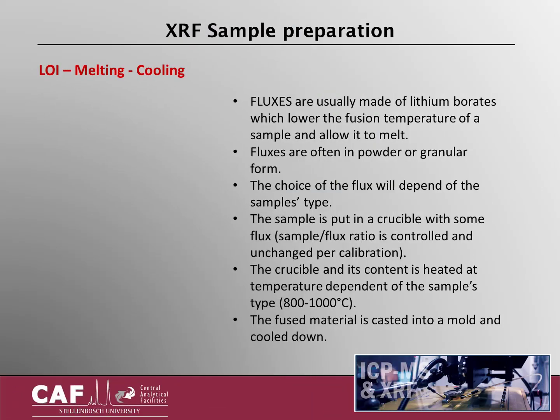Fluxes are usually made of lithium borate mixes and are classified by their ability to react with either a more acid sample or basic sample. Acid samples are high in silica, aluminium, iron or sulfur oxide, whereas basic samples are high in calcium, magnesium, potassium and sodium oxides. The choice of flux will thus depend on your sample type.